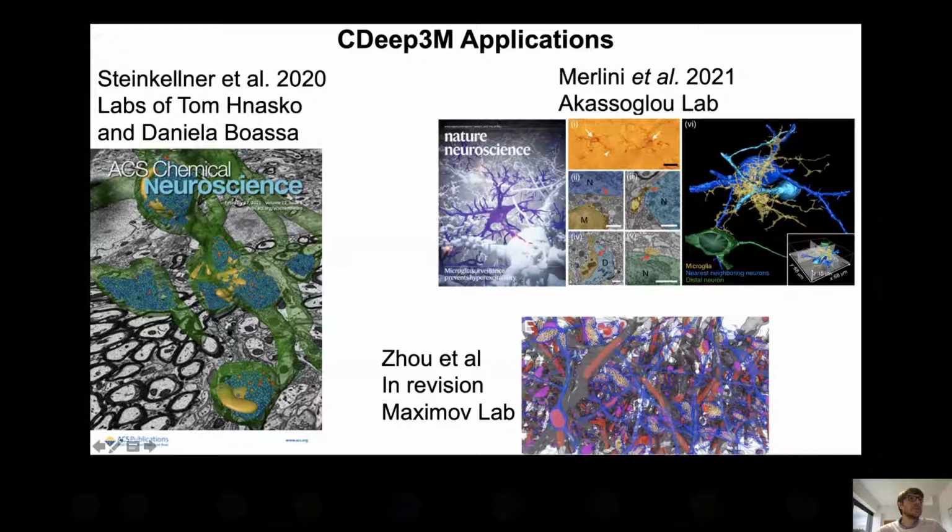Here we did segmentations of the presynaptic vesicles, and we have a tag for a certain neurotransmitter, which is illustrated in color here, the vesicles that contain this neurotransmitter. On the upper right, you see microglia segmentation. On the lower right end, you see neuron segmentation with also vesicles and mitochondria and many of the intracellular organelles.